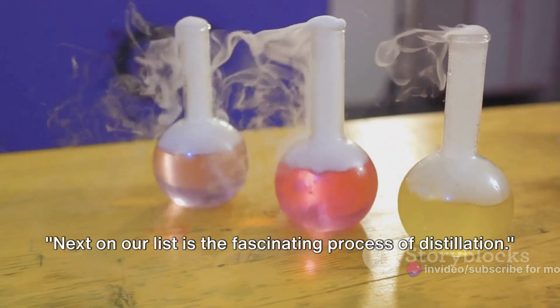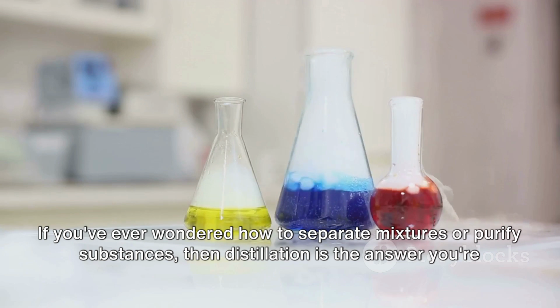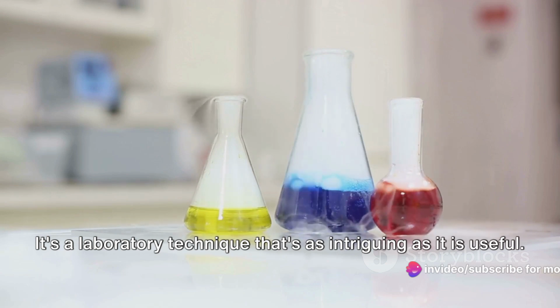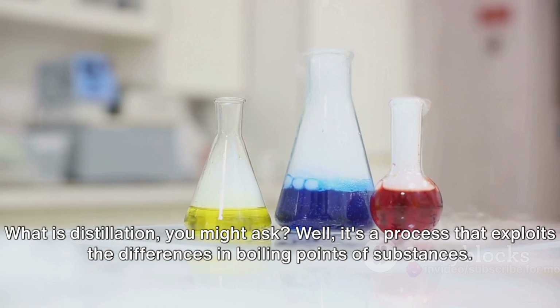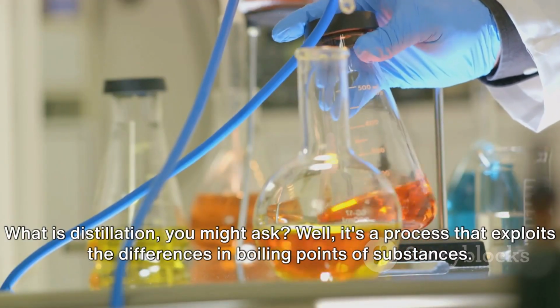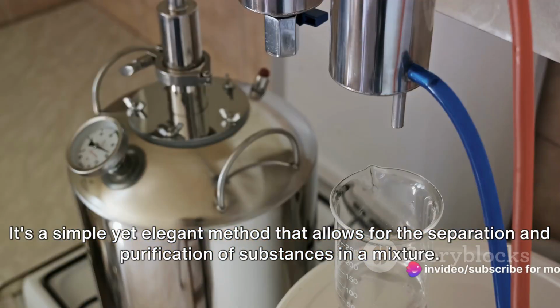Next on our list is the fascinating process of distillation. If you've ever wondered how to separate mixtures or purify substances, then distillation is the answer you're looking for. It's a laboratory technique that's as intriguing as it is useful. What is distillation, you might ask? Well, it's a process that exploits the differences in boiling points of substances. It's a simple yet elegant method that allows for the separation and purification of substances in a mixture.